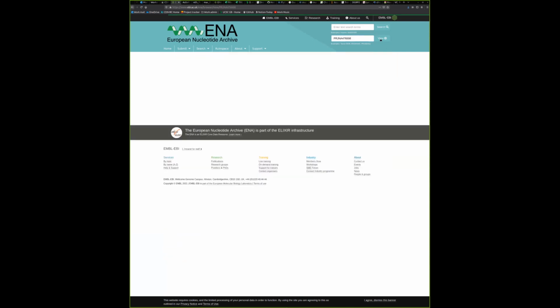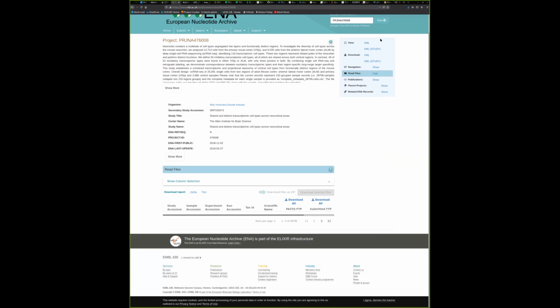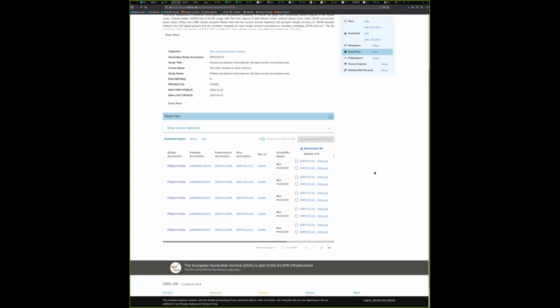click on view. And you can see a description of this project, where it's coming from, when it was created, as well as all the sequencing files that were associated with this project.